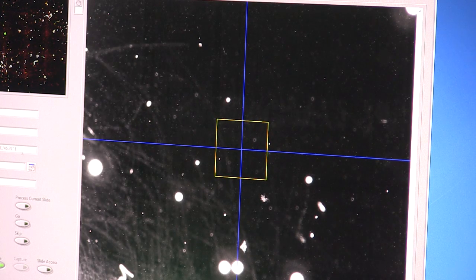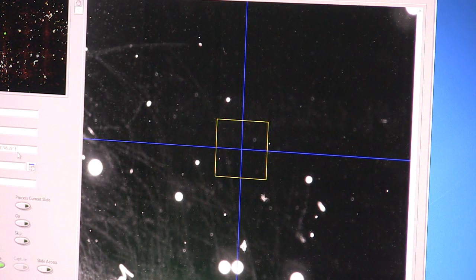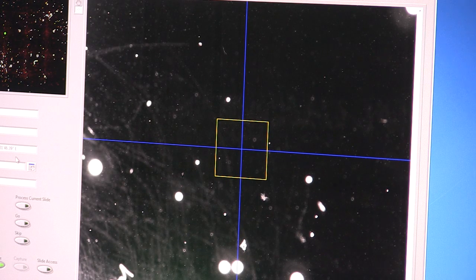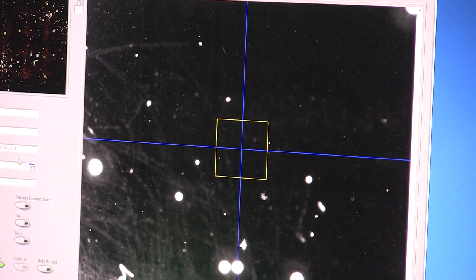And so once that is done we can then ask the system to image every pollen object that it's identified on that slide.